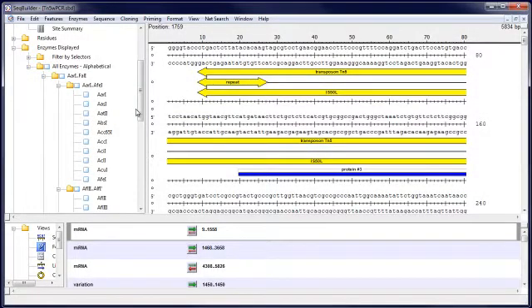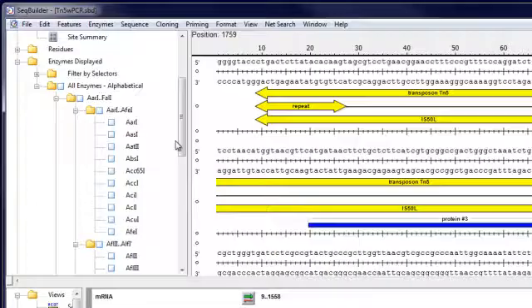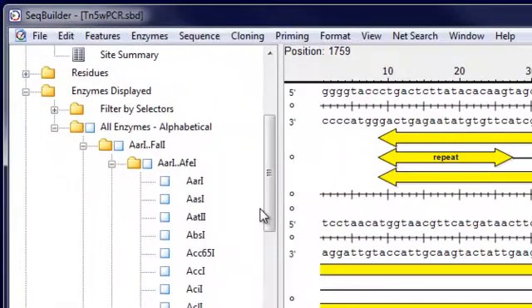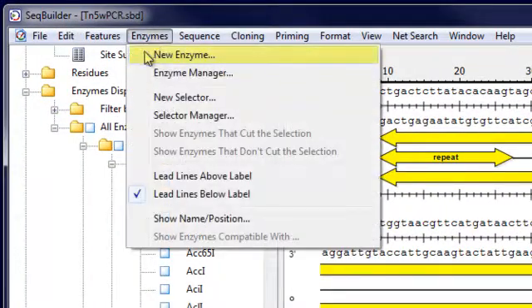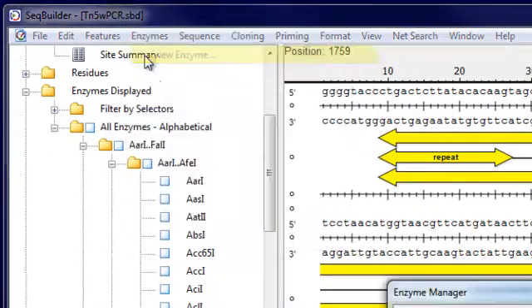To add a new restriction enzyme to the list of available enzymes in SeqBuilder, first go to Enzymes, New Enzyme.